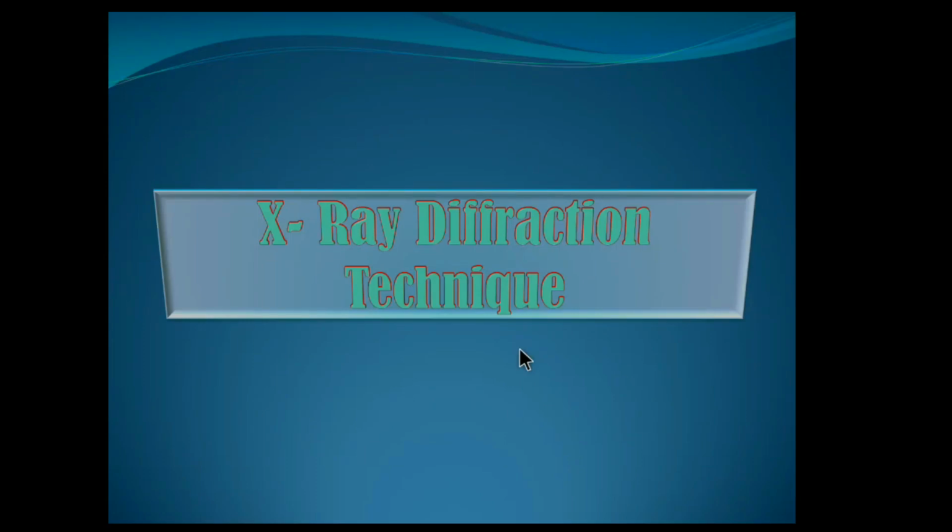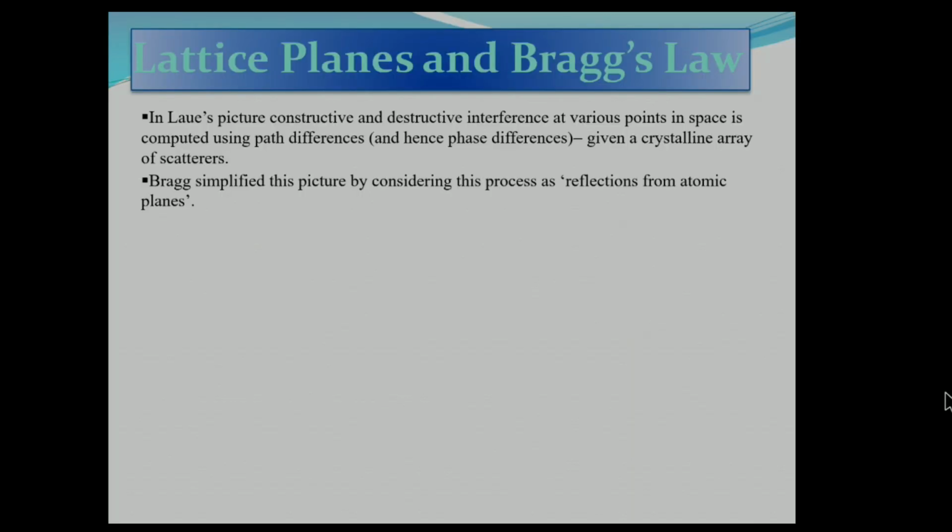In this lecture, we'll be discussing the XRD technique, which is the fifth module of the paper Experimental Techniques at Calicut University. So, as the basics of the X-ray technique, let us first discuss lattice planes and Bragg's law.